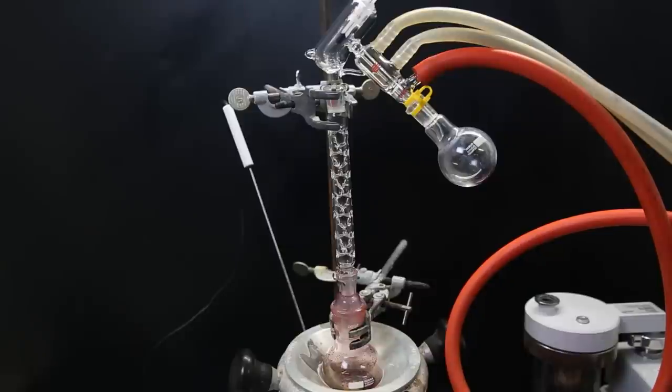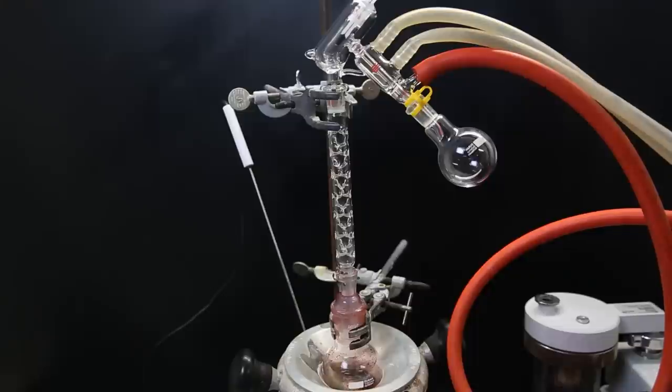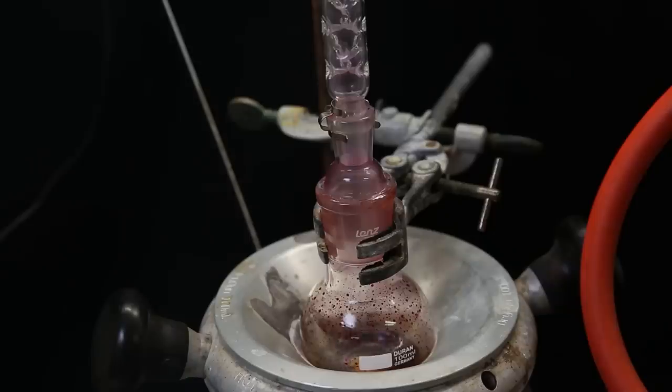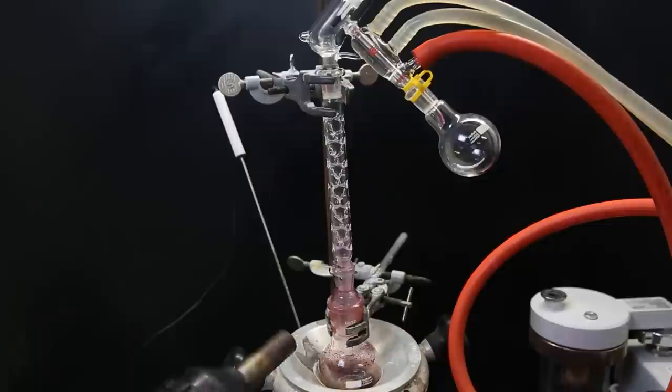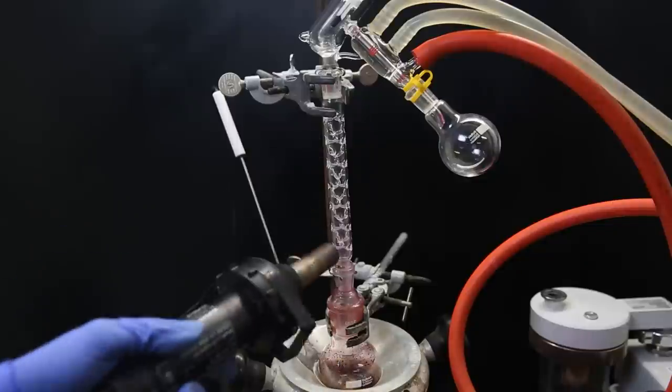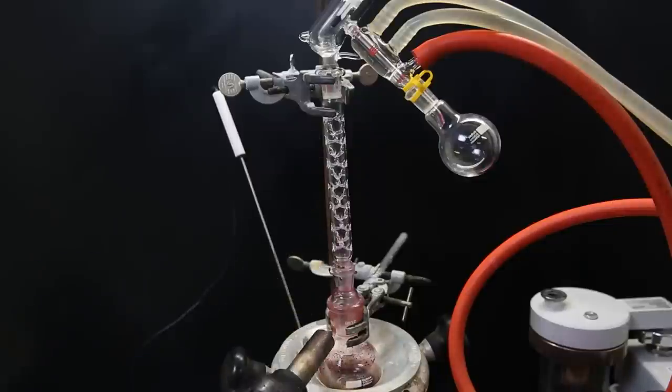I replace it with a small fractionating column, with a small short path distillation apparatus on top. In between the pump and the apparatus is a trap, and I pull a strong vacuum on the setup. I increase the heating strongly, and start assisting the distillation with a heat gun. At this low pressure and high temperature, I can simply distill over the thiobenzoyl chloride.